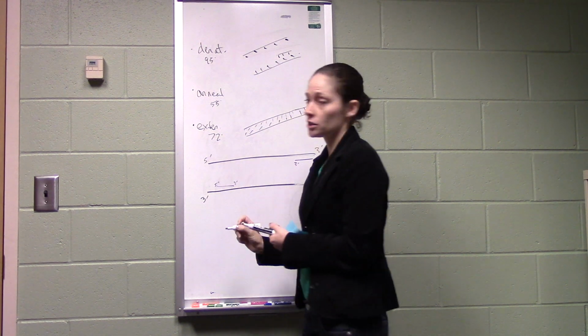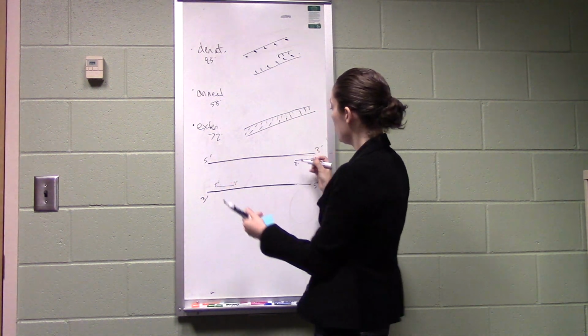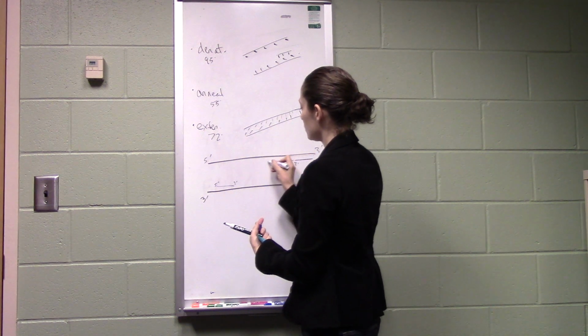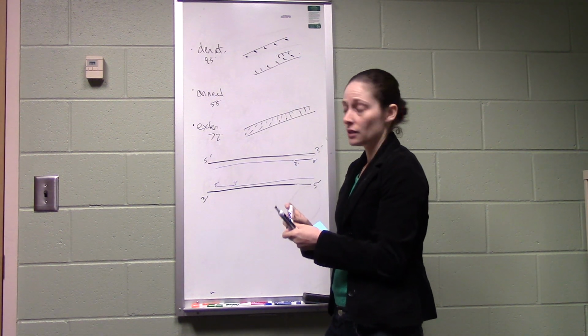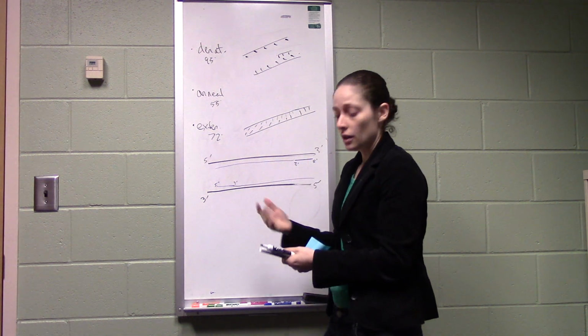So a PCR reaction needs 2 primers kind of flanking the region that you want to amplify, and the 3' ends need to sort of point to each other because polymerase will add to the 3' end. So it will add in this direction and add in this direction. Make sense? In the next round, when these separate, these purple strands can now be a template as well.